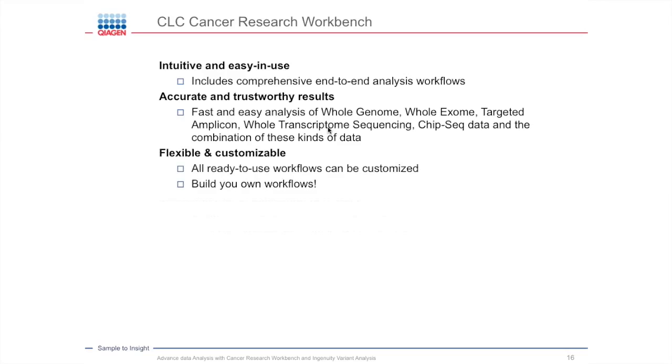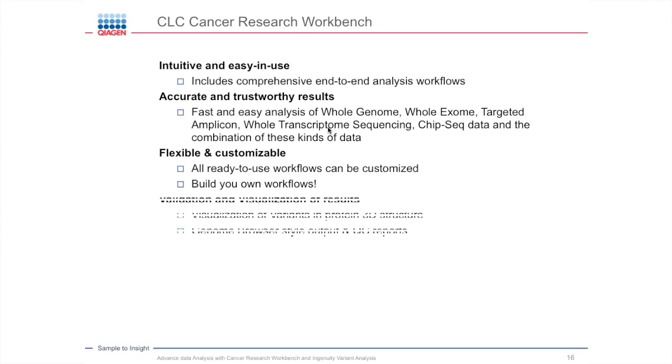It's flexible and customizable. So for those of you that have a deeper bioinformatics background, you can actually customize any of the ready-to-use workflows. You can also build up those workflows and add different steps that you would like. So it's providing you that flexibility, so it's not a black box. You can actually see all the different workflows and make them for your own specific pipeline.